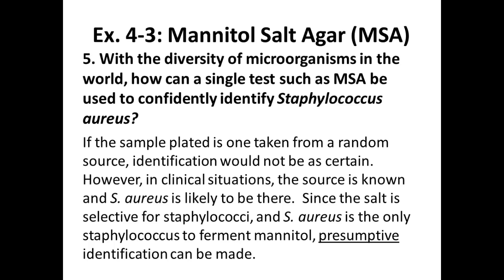For you guys, we did a whole bunch of tests leading up to this one test, and this is more of a confirmatory for you guys. Where in a lab, they might start in the opposite direction. They might put it on this plate and then run the additional tests, because this would help narrow it down for them, right? Make sense? Okay.